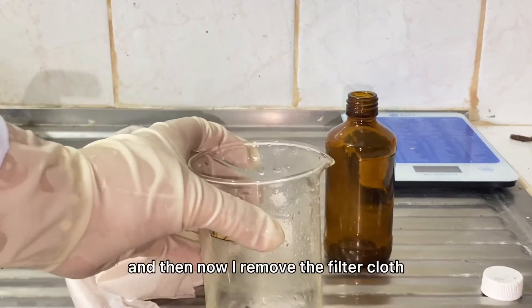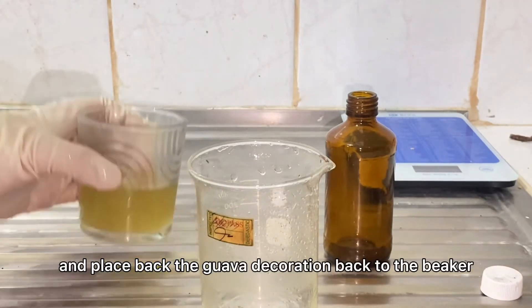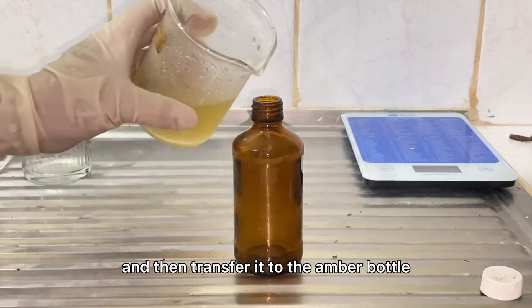I remove the filter cloth and place the guava decoction back into the beaker, then transfer it to the amber bottle.